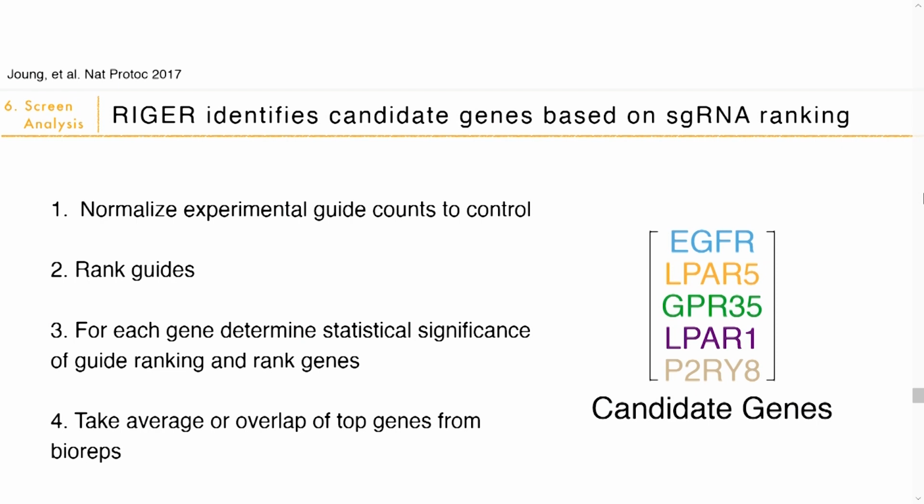In the protocol, we describe how to use RIGER, but at this point, RIGER is fairly outdated. Most people in our lab actually use MAGeCK to analyze our screens, and I would recommend looking into using MAGeCK for analyzing your screens. But RIGER and MAGeCK and any other screening analysis program are very similar in that they follow a similar trajectory.